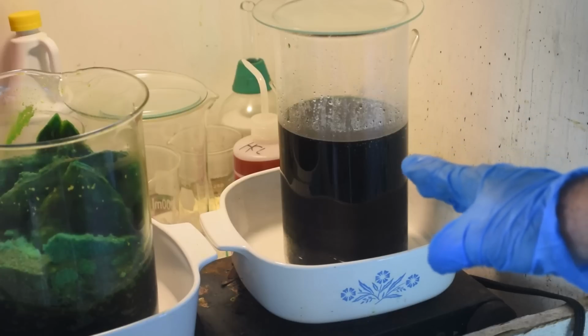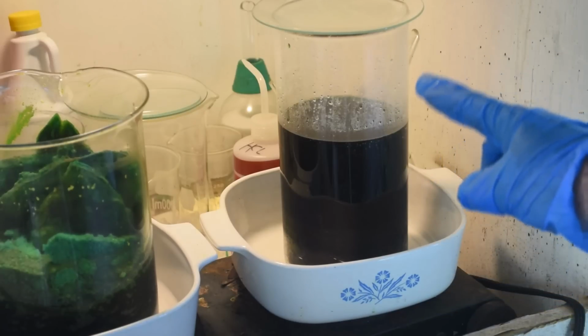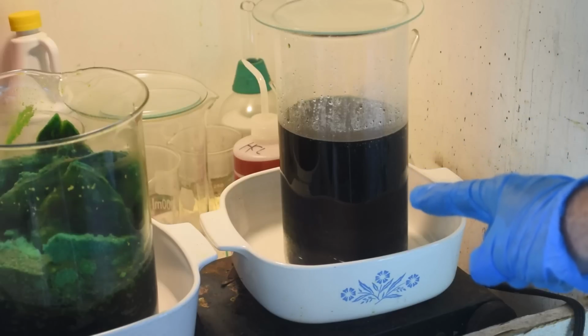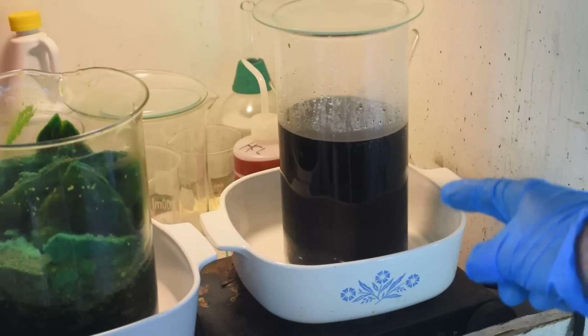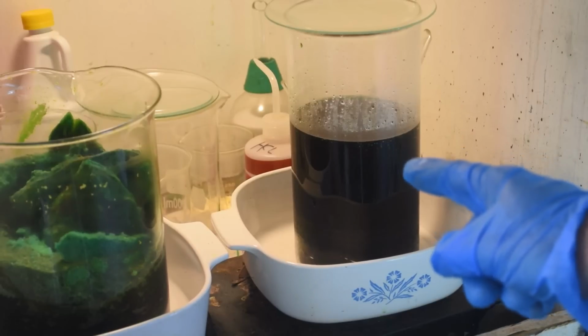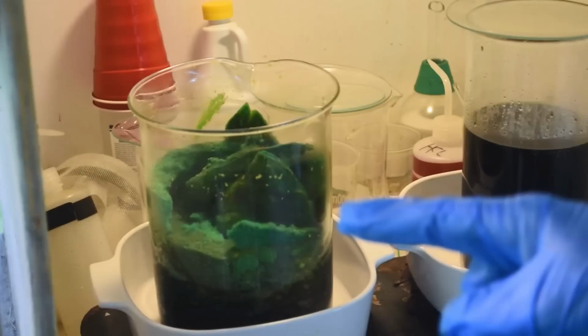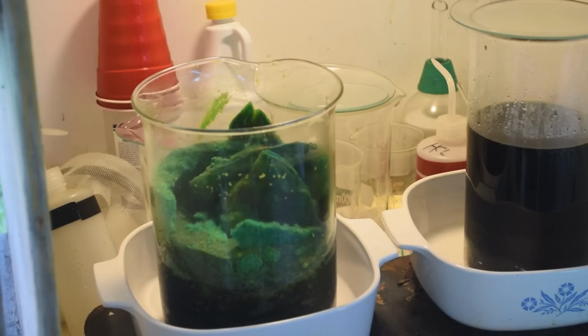Now, I could process this liquid and get the palladium out of it, I'm pretty sure. I'm pretty sure there's a lot of palladium chloride in here. It is soluble in hydrochloric acid, so there should be a lot of it in there. Thing is, I'm sure there's still a lot of it stuck in here too. So I don't know if I want to process this yet. Let me see if I can get some more out of here. And how do I want to do that? That's the question.